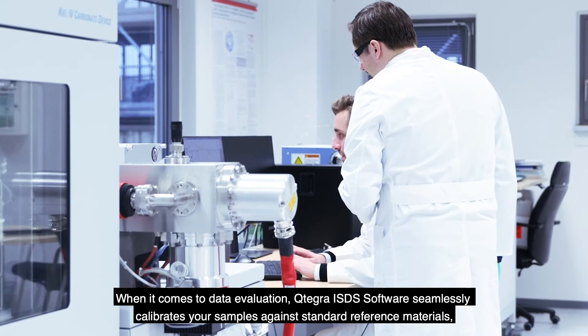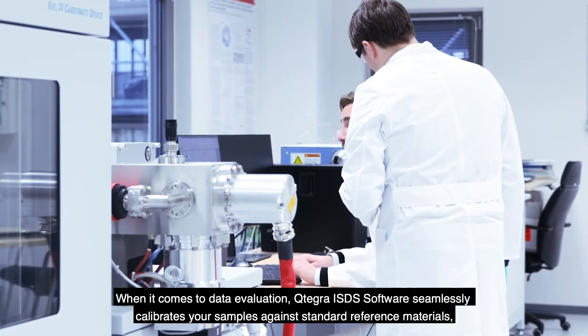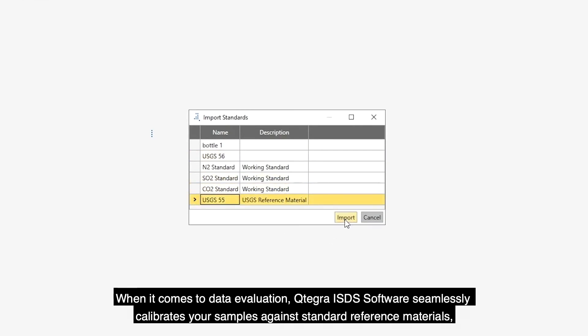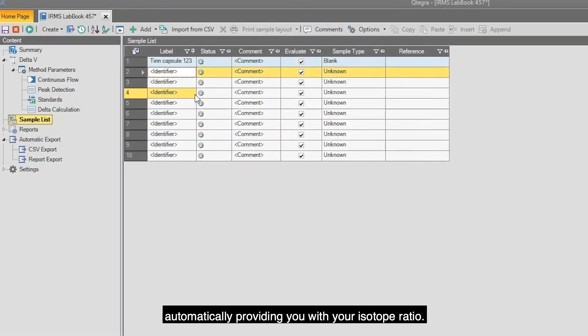When it comes to data evaluation, Qtegra ISDS Software seamlessly calibrates your samples against standard reference materials, automatically providing you with your isotope ratios.